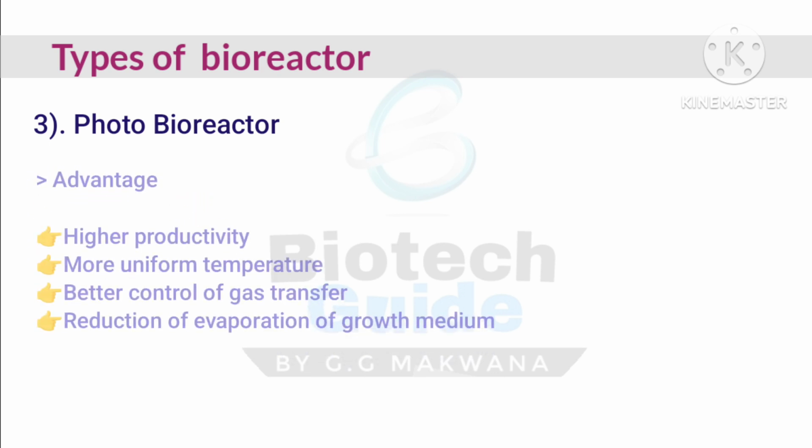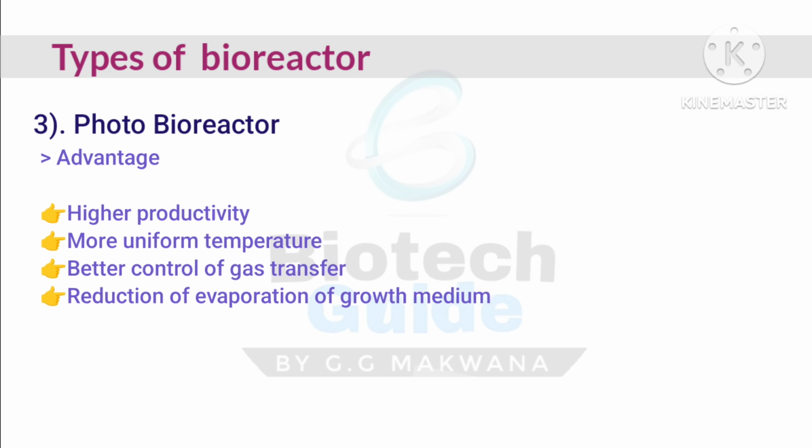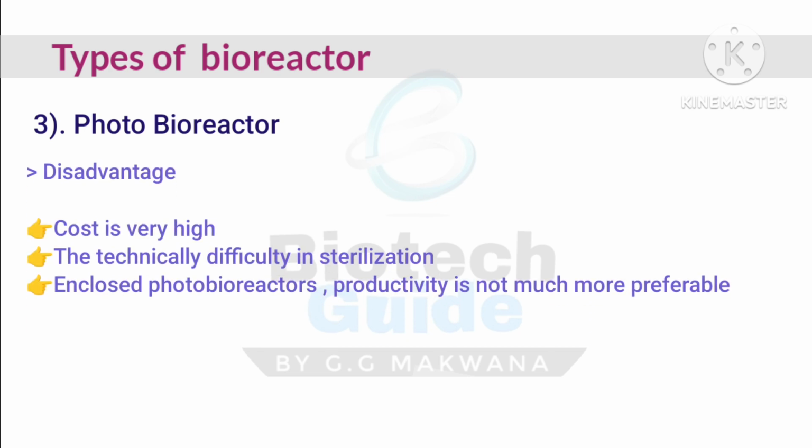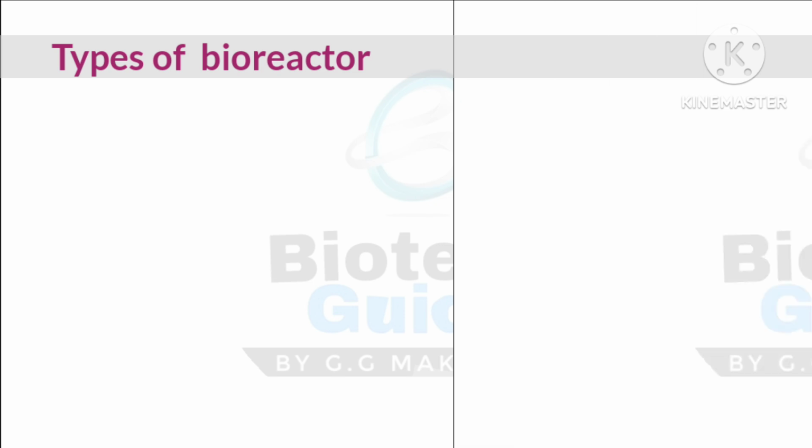Then advantages and disadvantages: higher productivity, more uniform temperature, better control of gas transfer, and reduction of evaporation of growth medium are the advantages. And the disadvantages: cost is very high, technical difficulty in sterilization, and enclosed photobioreactor productivity is not much preferable.